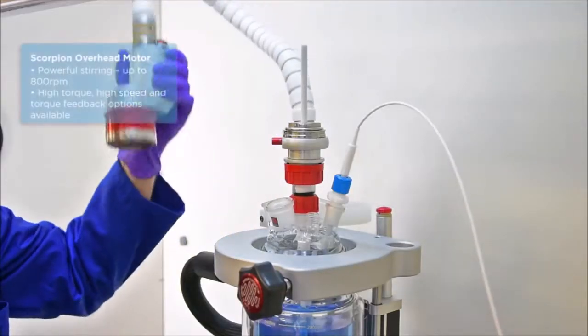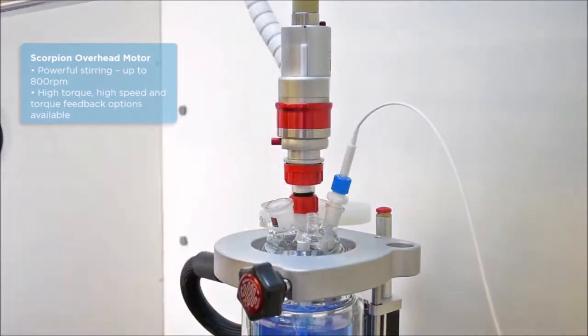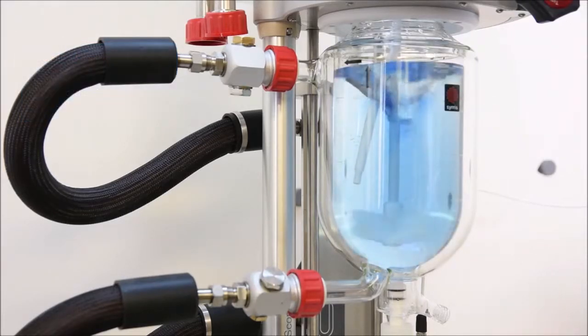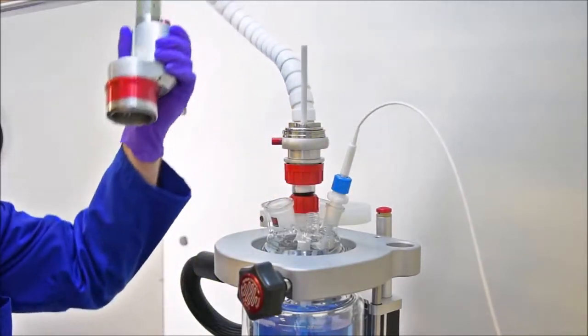Offering speeds of up to 800 RPM, the Scorpion overhead stirrer motor is easily clicked into place with no awkward scaffolding to deal with. The quick release system disconnects the stirrer motor, ready to be stored away on the frame.